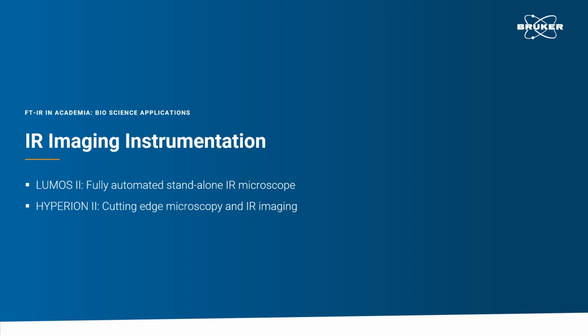Before we close this presentation and step into the question and answer session, I will now briefly introduce the measurement equipment needed for making these spatially resolved IR measurements.